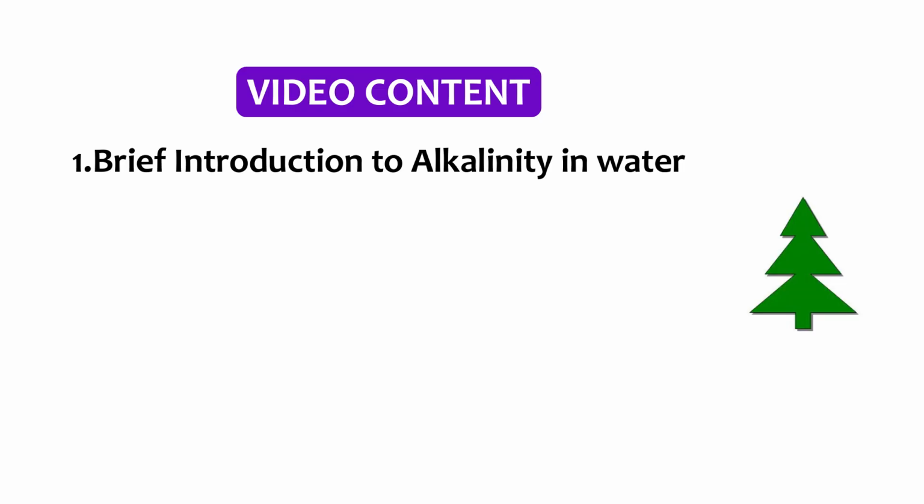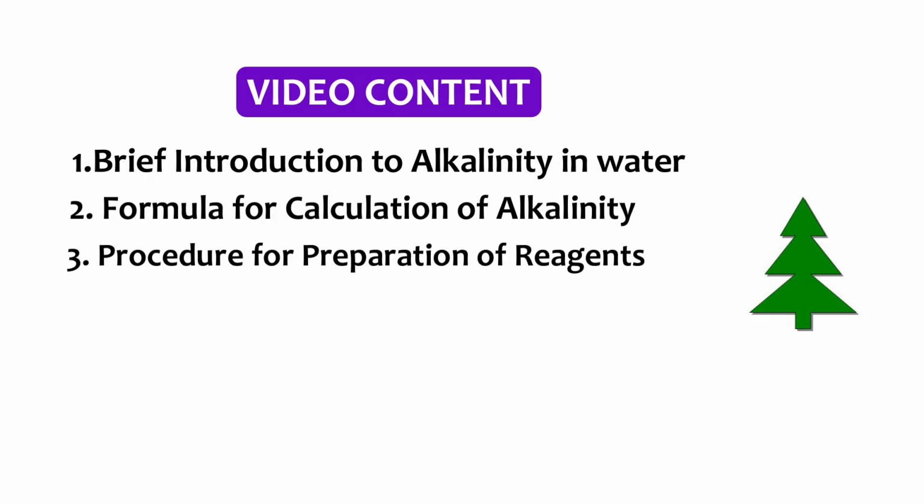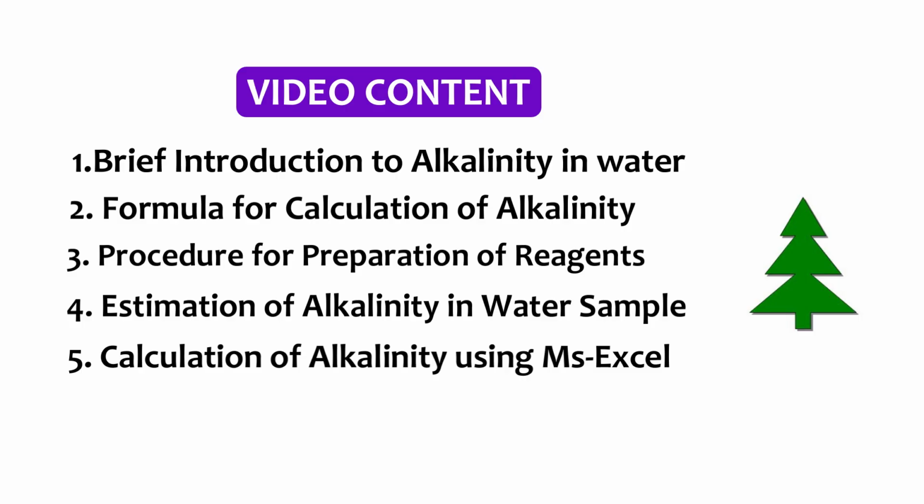On the first step, we'll have a brief introduction to alkalinity in water, and in stage 2, we'll see the formula for calculation of alkalinity, and in stage 3, I'll demonstrate to you the procedures for preparations of reagents required for analysis of alkalinity in water samples, and in stage 4, I'll demonstrate the procedure for estimations of alkalinity in water samples, and last but not the least, in stage 5, I'll demonstrate to you the calculation of alkalinity using Microsoft Excel.